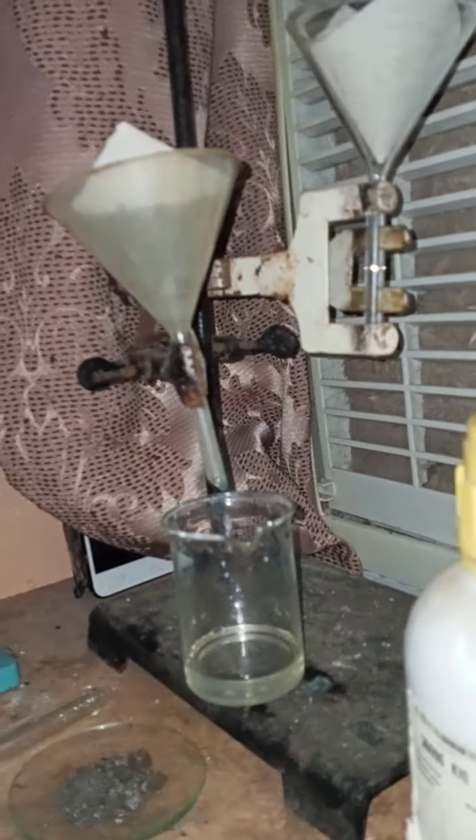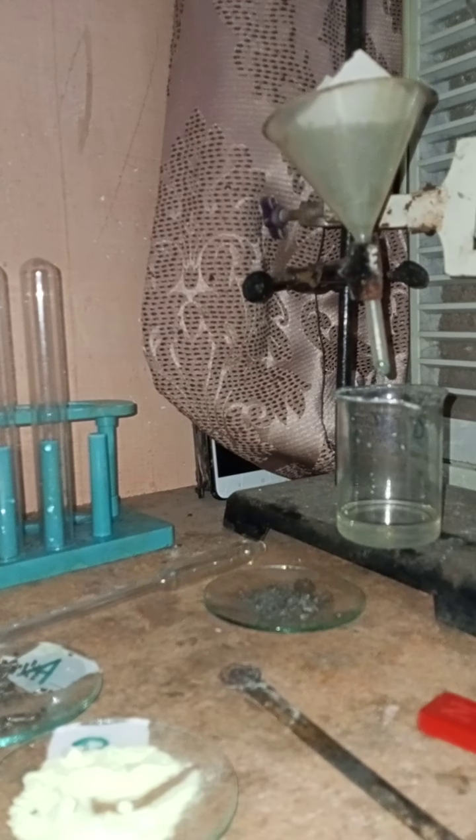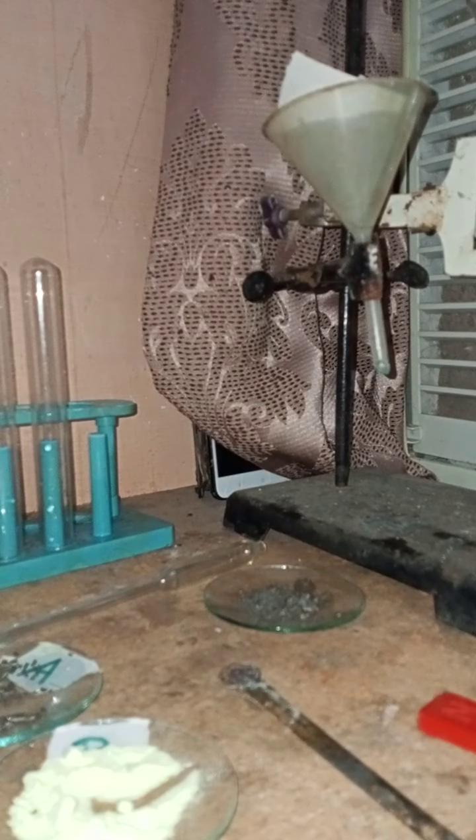We have added it, and we cannot see anything on this filter paper. There is no sulfur powder left on the filter paper, and all this carbon disulfide has the sulfur powder dissolved in it, and we can keep it again back in the test tube.